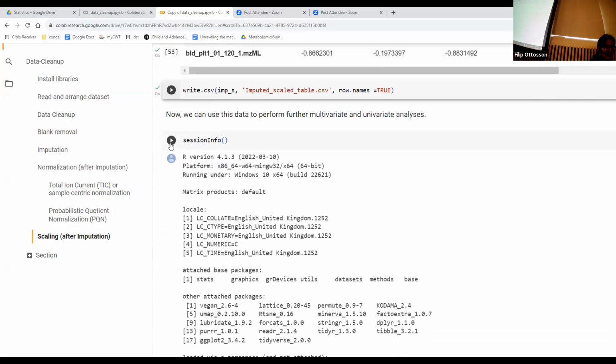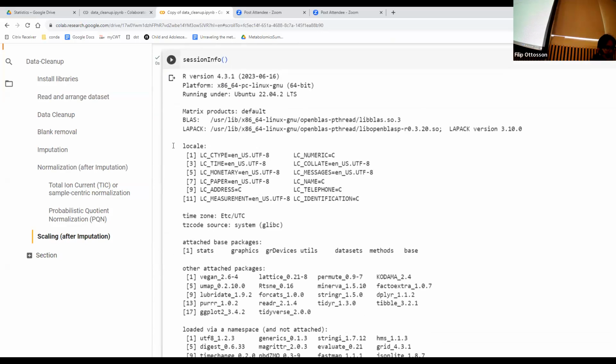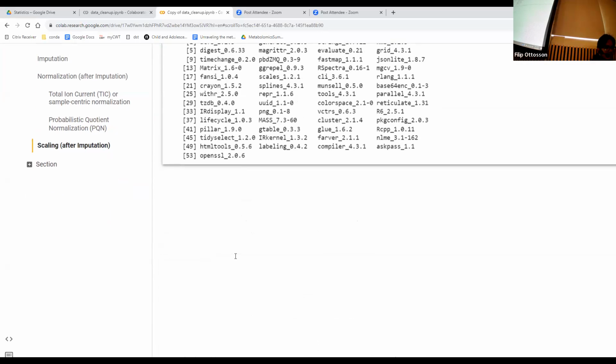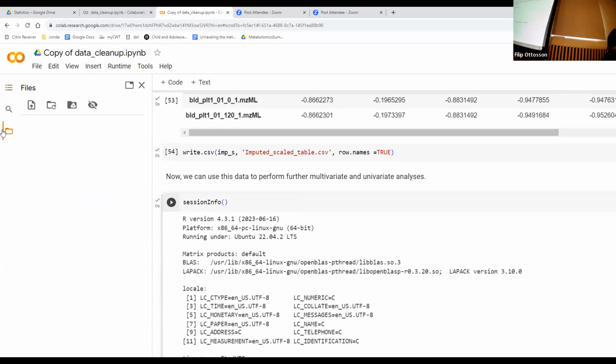They have a question about where all the outputs end up, if you can show where the CSV files are and so on. Sure. So here, on your left side, if you click on this file button, you would see the files that you have saved.